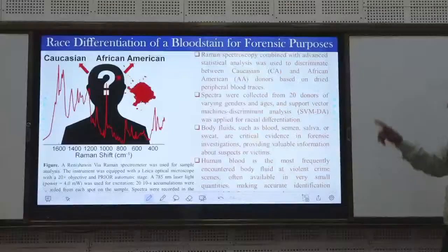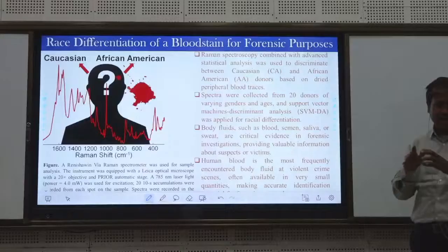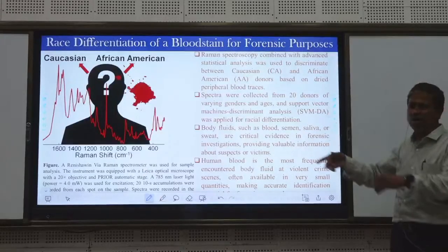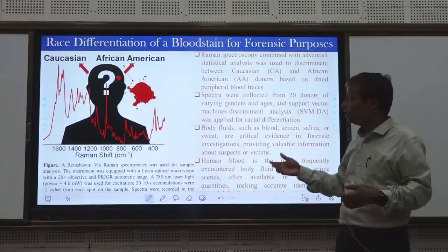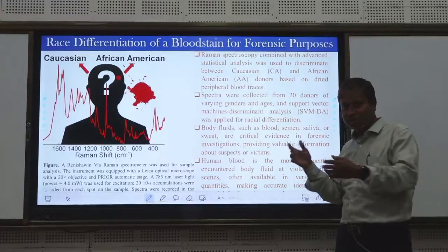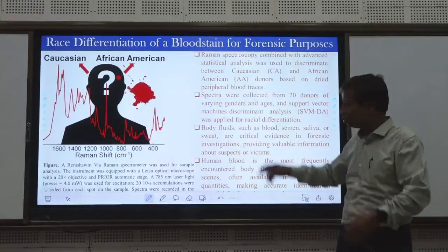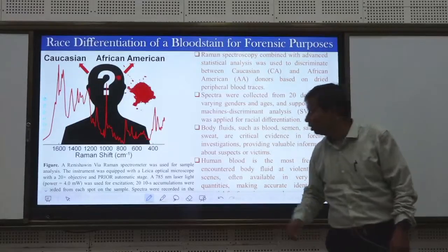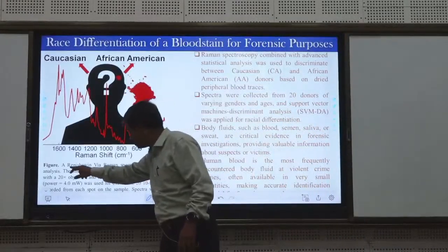This is another thing, whether, mainly in America, Caucasian and African American can be distinguished, whether your Caucasian is an older generation, so whether this race has come from that race or not. They have said that it is possible.